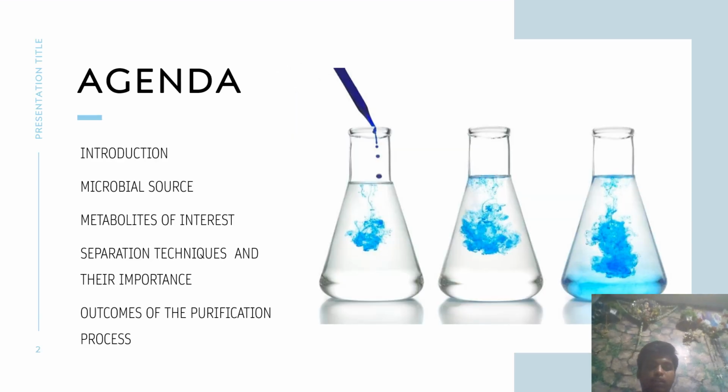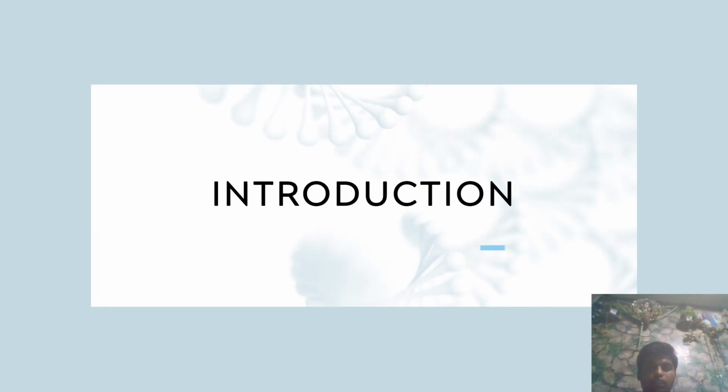So the agenda we are going to discuss is the introduction, which is the general overview of the topic, the microbial source, the metabolites of interest, separation techniques and their importance, and the outcome of the purification process. So moving on with the introduction.